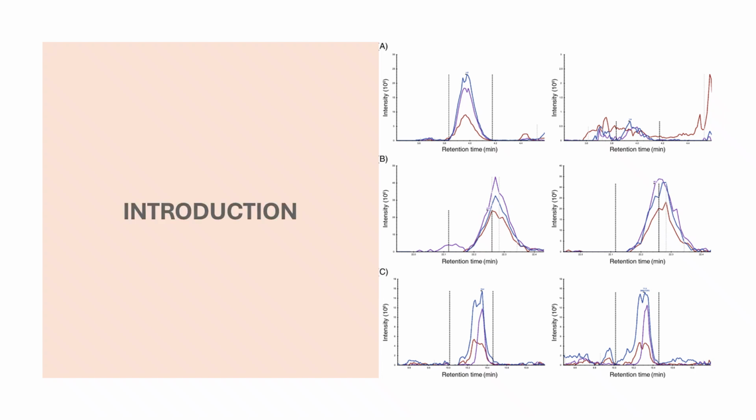Hello everyone. Today I'll be discussing a critical challenge in mass spectrometry chromatography. That is, identifying and tackling false negative and false positive peaks in LC-MS-MS and GC-MS-MS analysis.